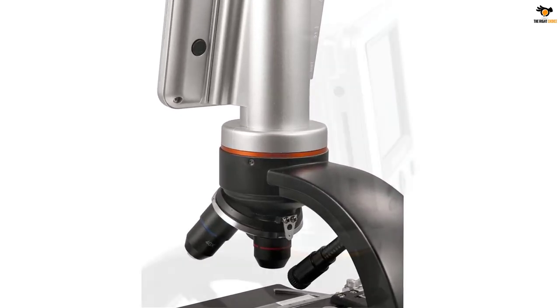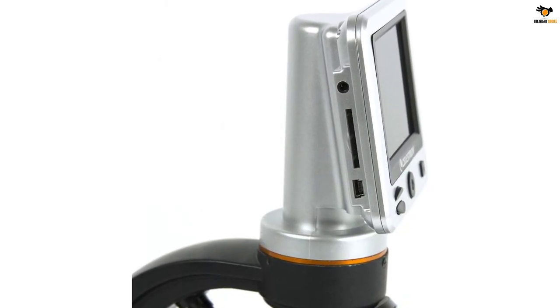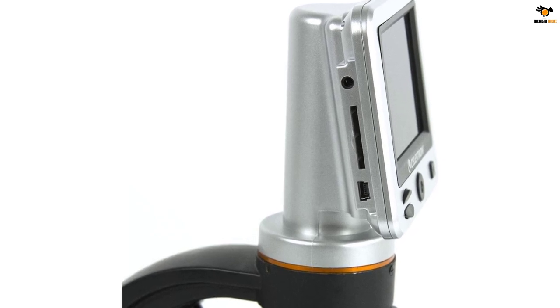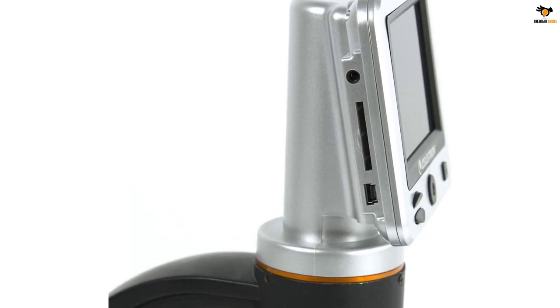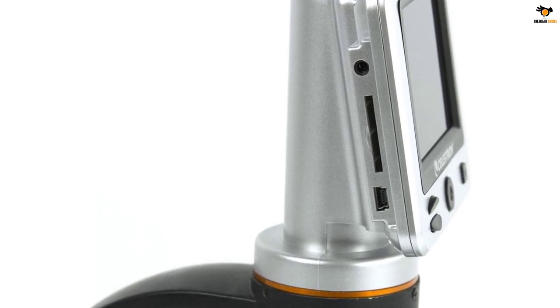The Celestron biological microscope has a built-in 5-megapixel digital camera that captures high-resolution images and 30fps video of your specimen, as well as a full-color 3.5-inch TFT LCD screen with onboard software.